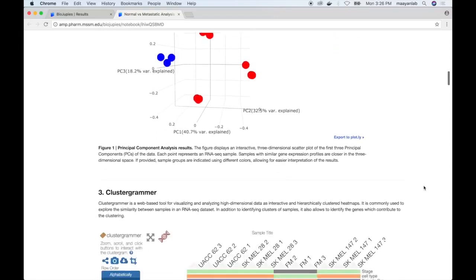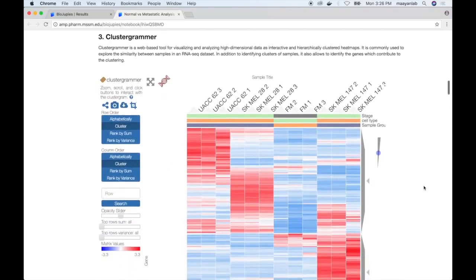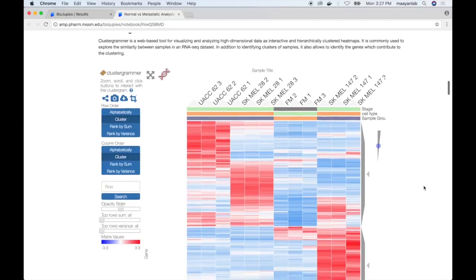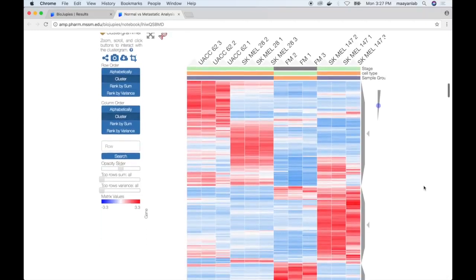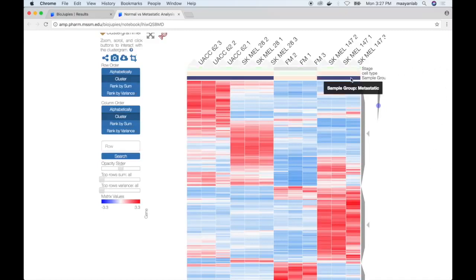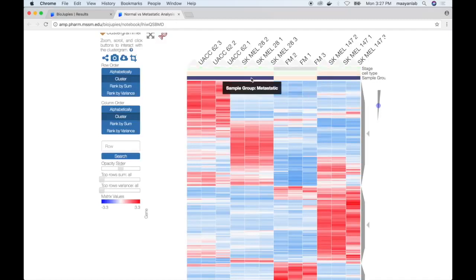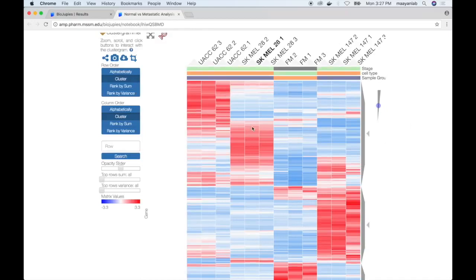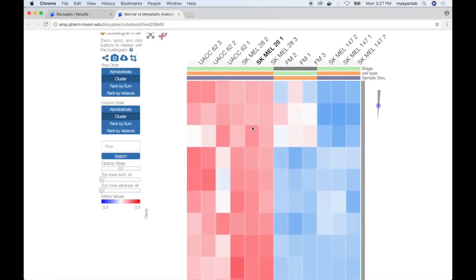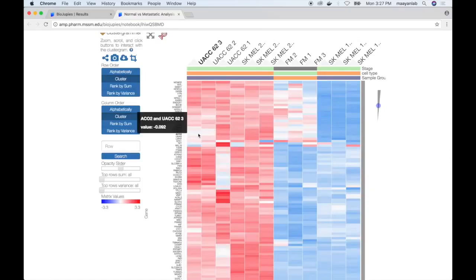Scrolling down reveals the second plugin results, which is the interactive heatmap displayed using Clustergrammer. The rows represent different genes determined by filtering based on variance, columns indicate the samples, and the colors indicate different groups that the samples belong to. We can see that the normal samples tend to cluster together, and samples generated using different metastatic cell lines also cluster together. The user can optionally zoom in on the heatmap and hover over each individual point to reveal more information about the expression of each gene.